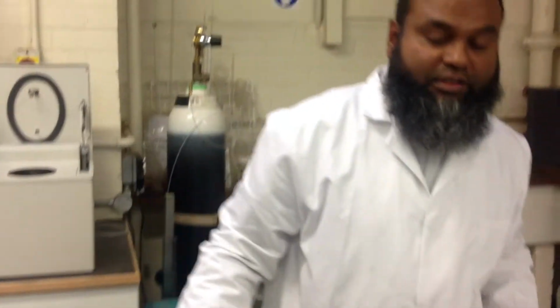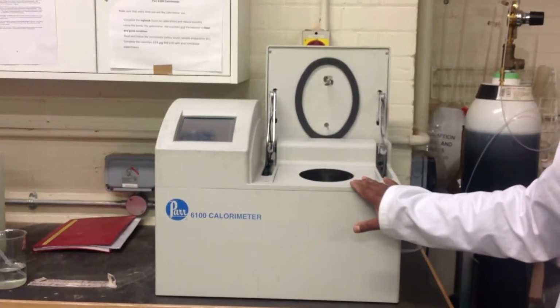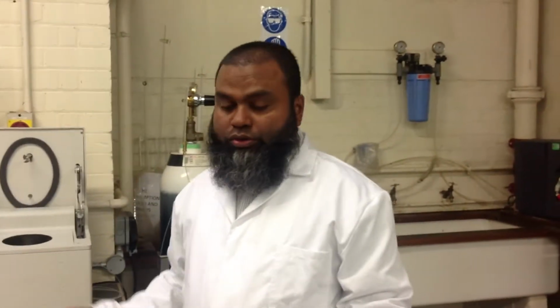Here you will select one liquid fuel, either petrol, diesel or biodiesel, and another one a solid fuel, which is normally biomass fuel. So what is the principle behind the measurement of heating value? In our lab we have a calorimeter, which is a Parr 6100 calorimeter. This is a semi-automated type calorimeter. We use this calorimeter to measure the heating value of the fuels.